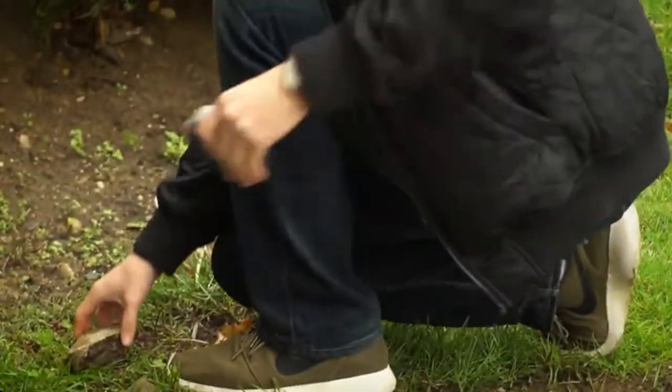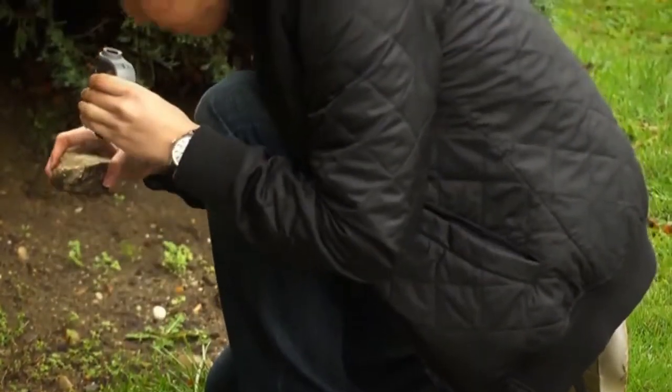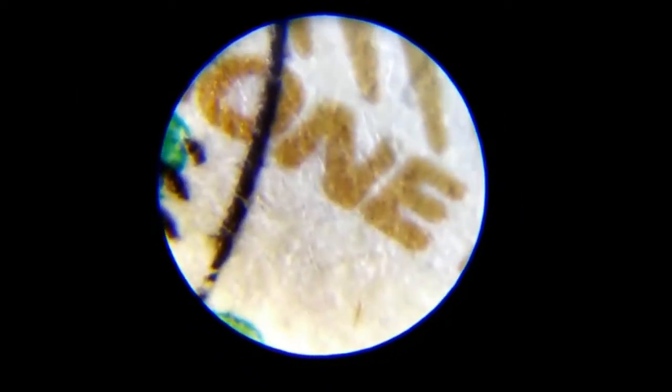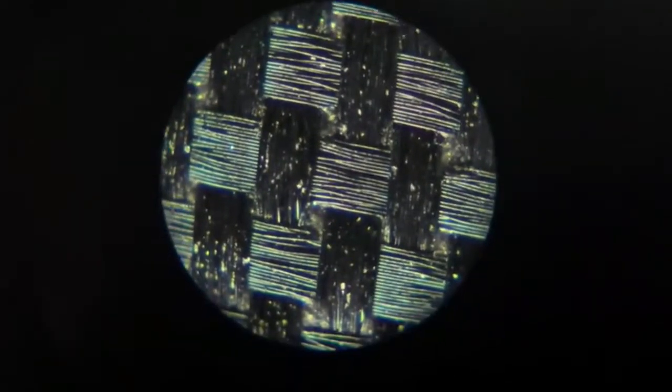So pocket microscopes, if you don't need a traditional microscope and you're looking for something a little more portable then you're gonna love the micro bright plus. You can look at literally anything. A couple fun things to look at are the hidden things found on currency like the micro printing, and any type of fabric looks great under this thing.